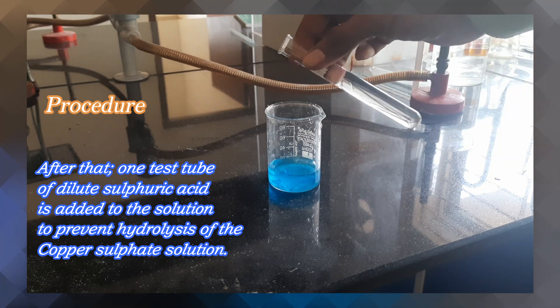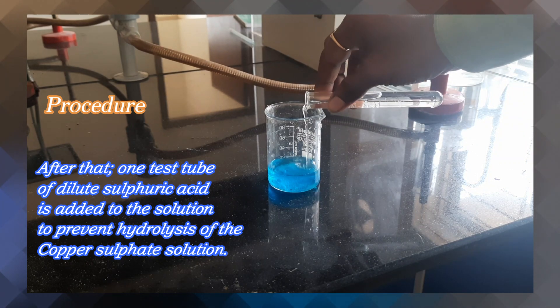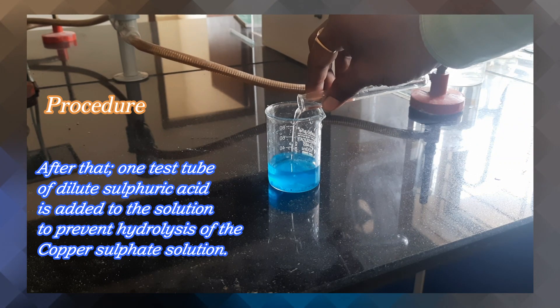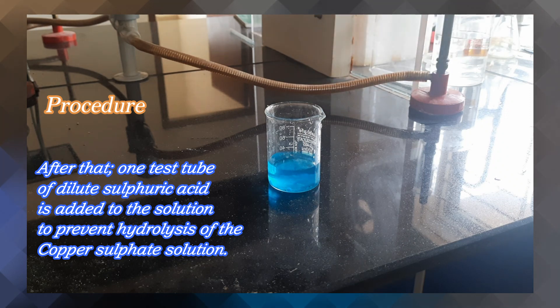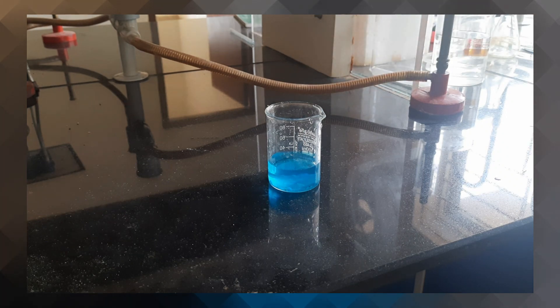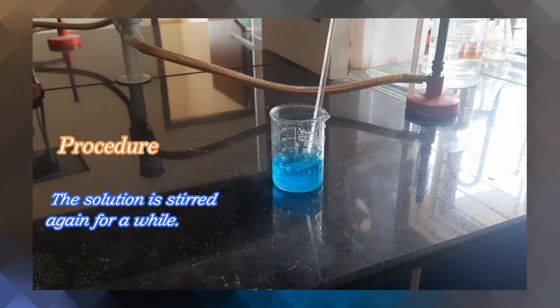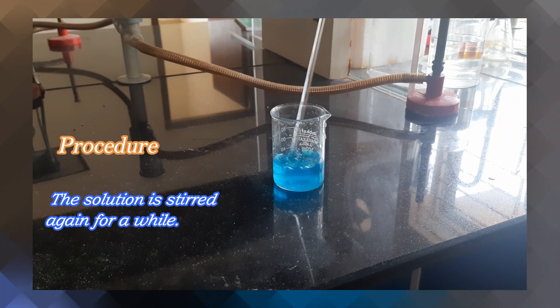After that, one test tube of Dilute Sulphuric Acid is added to the solution to prevent hydrolysis of the copper sulphate solution. The solution is stirred again for a while.